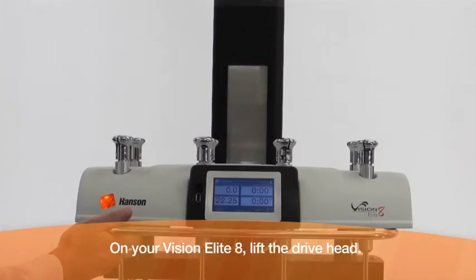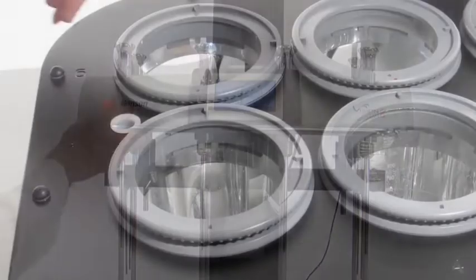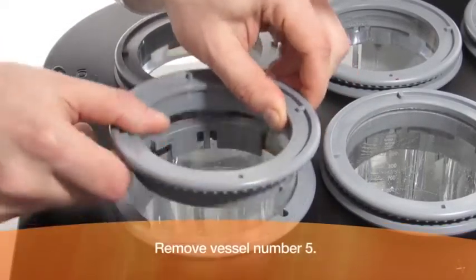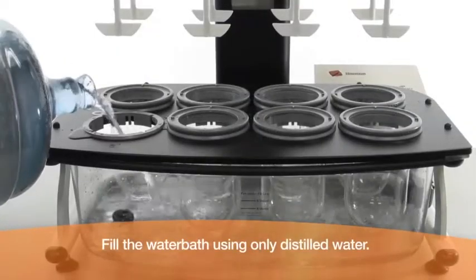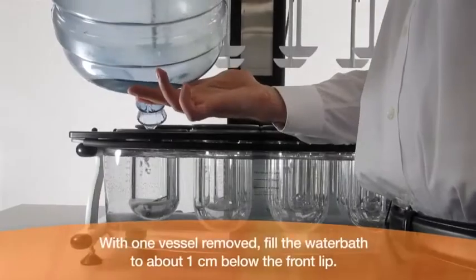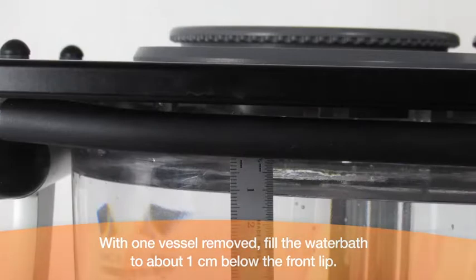On your Vision Elite 8, lift the drive head. Remove vessel number 5. Fill the water bath using only distilled water. With one vessel removed, fill the water bath to about 1 cm below the front lip.